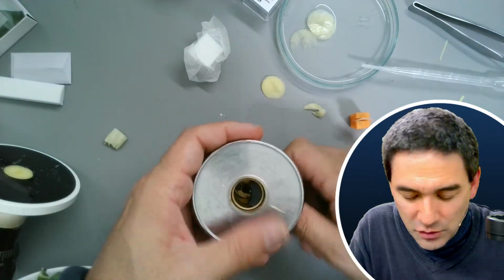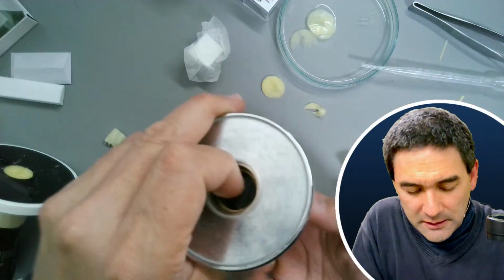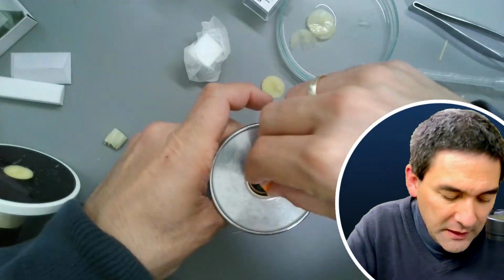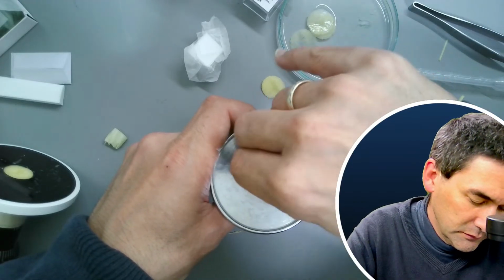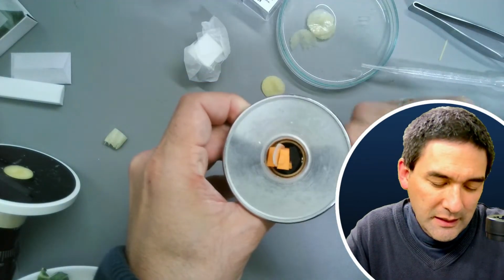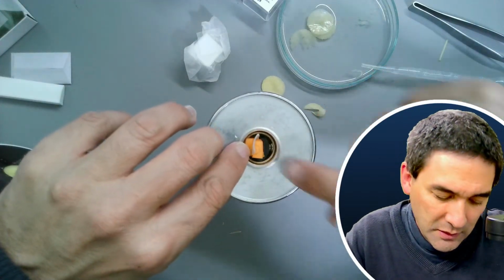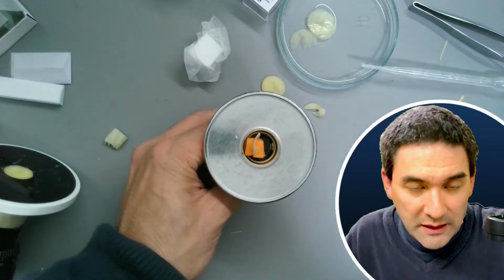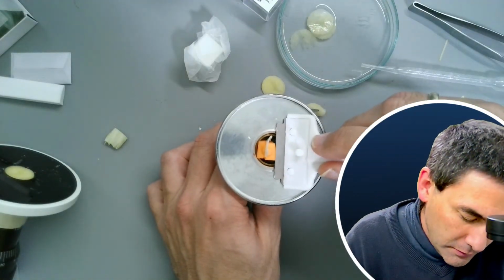So let's try this again. This is slightly experimental again for me. Am I able to fit it in here? Difficult. Okay, here we go. I have to clamp it down again. The problem is that if you clamp it down on the bottom, then the top part might sometimes come apart a little bit. So let's give it a try. Let's try the razor blade again. If I happen to cut myself, then I'm going to put some blood under the microscope.